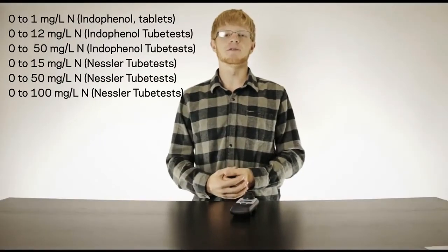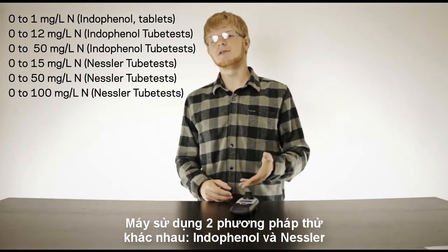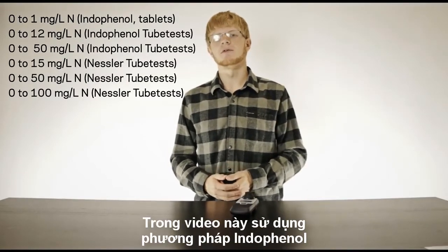As the name might imply, the Palantest Ammonia Duo offers two methods of analysis: the Nessler method and the Indophenol method. I'm going to use the Indophenol method for this example.